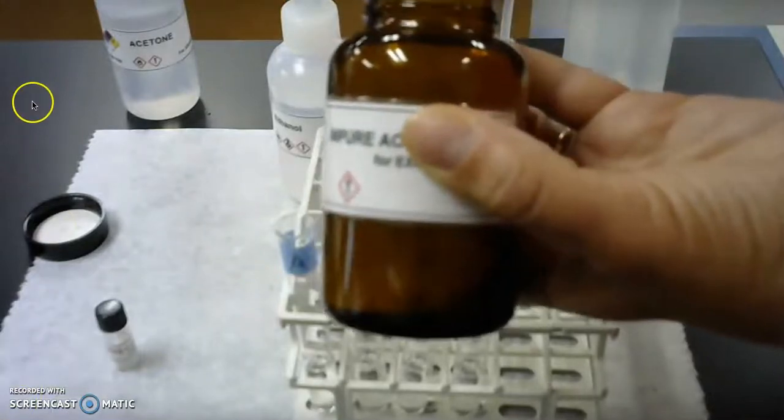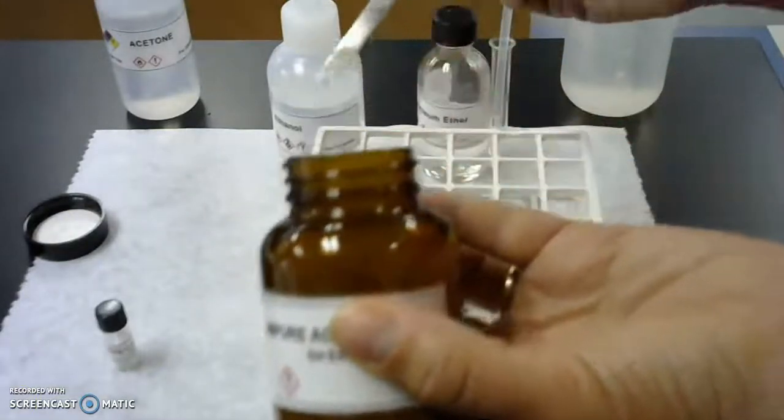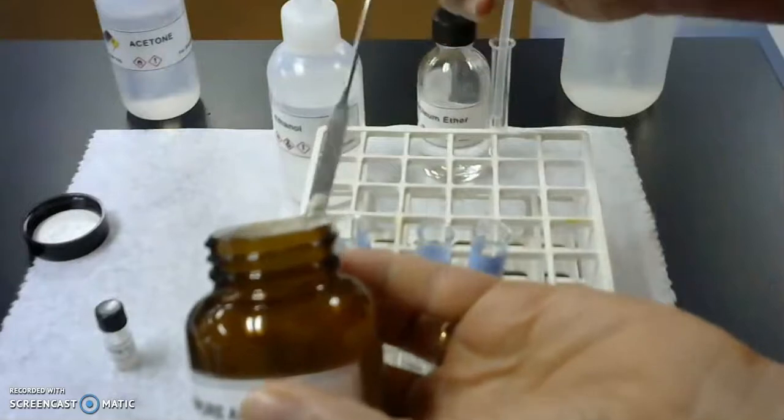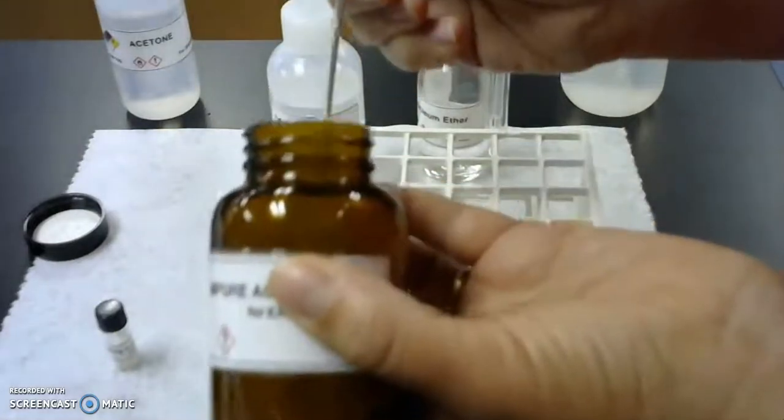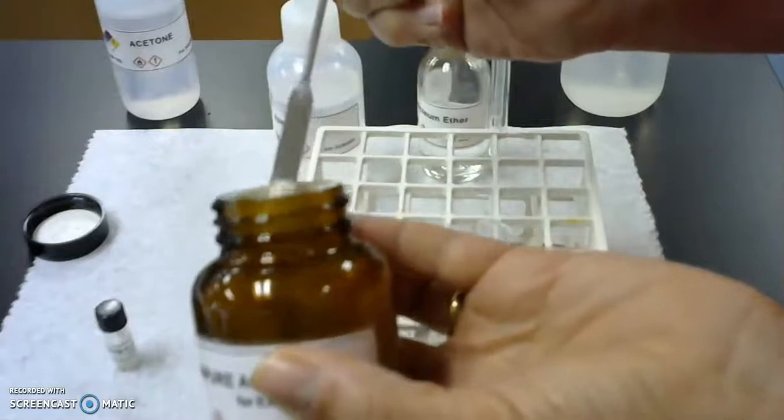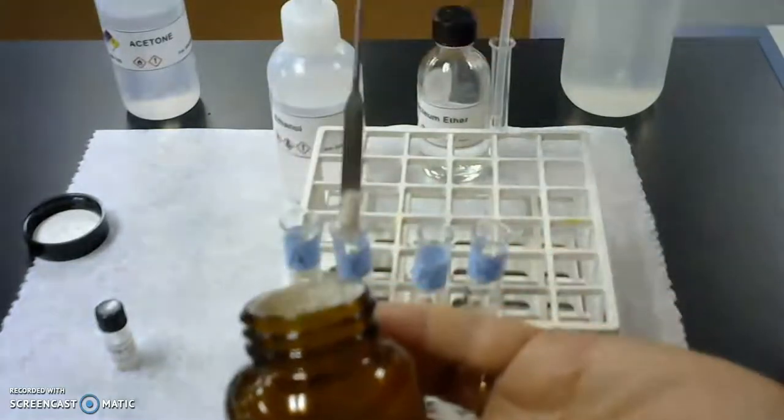So you can see how much I'm going to add right here right now. So just enough to cover the bottom third or so of the spatula, and I'll add the acetanilide to each of the test tubes.